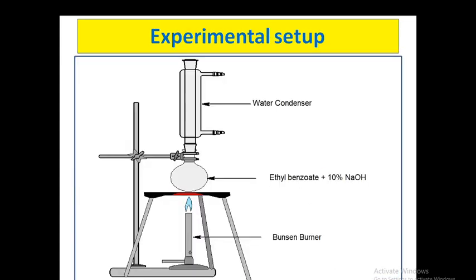Here is the experimental setup. In this round bottom flask we are taking ethyl benzoate and 10% NaOH and just heating it. A water condenser is attached to it.